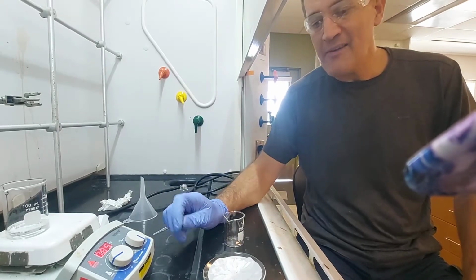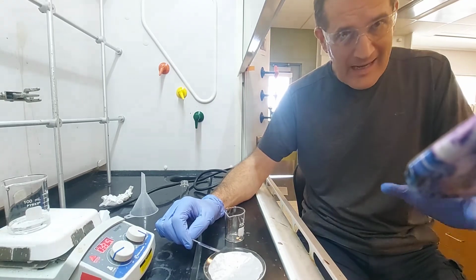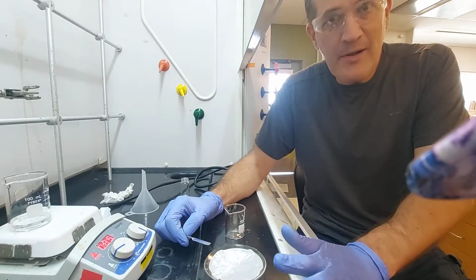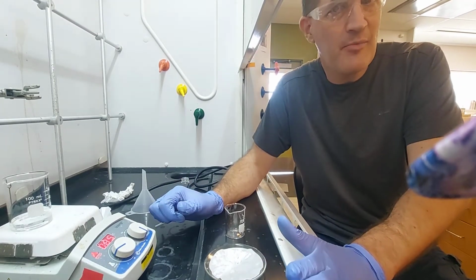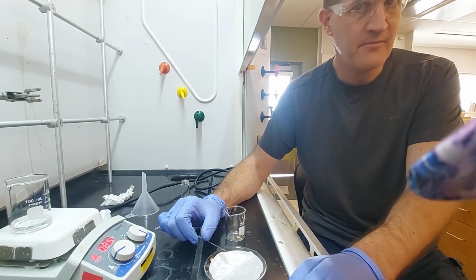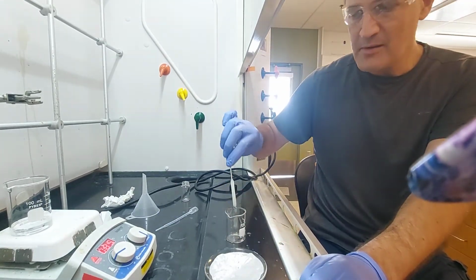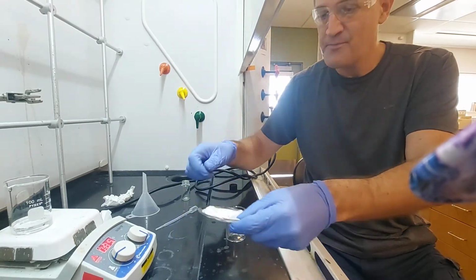Alright guys, so we have our drying product here. This is not going to be particularly dry yet, but hopefully drier than before. What I want to do is to recrystallize this. Recrystallization is a process we're going to use to purify this. My plan is to get this from the filter paper into this beaker.